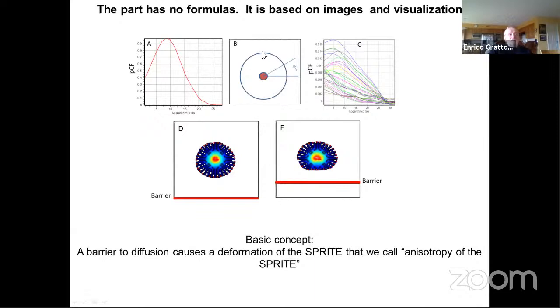Instead of showing each correlation function, which is very difficult to understand, I will show a surface, in which each one of those curves is shown. I have 32 points, or 36, I don't remember exactly. So I divide the angle into positions of 10 degrees. Every 10 degrees, I measure the correlation between this point and the point at the given distance.